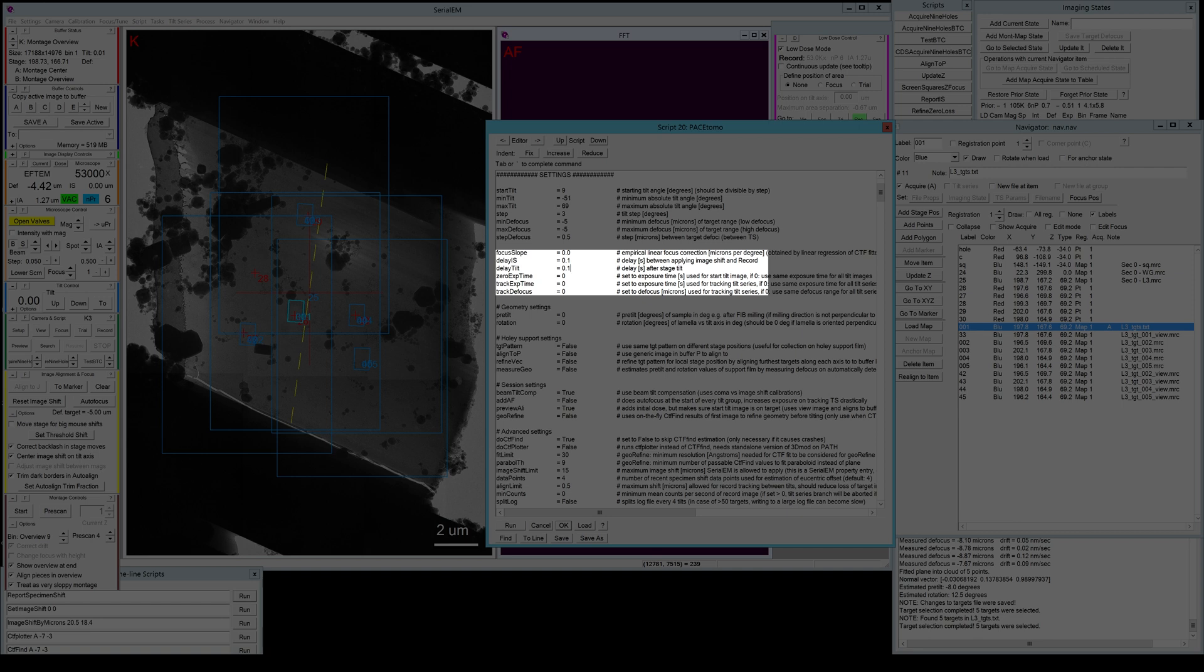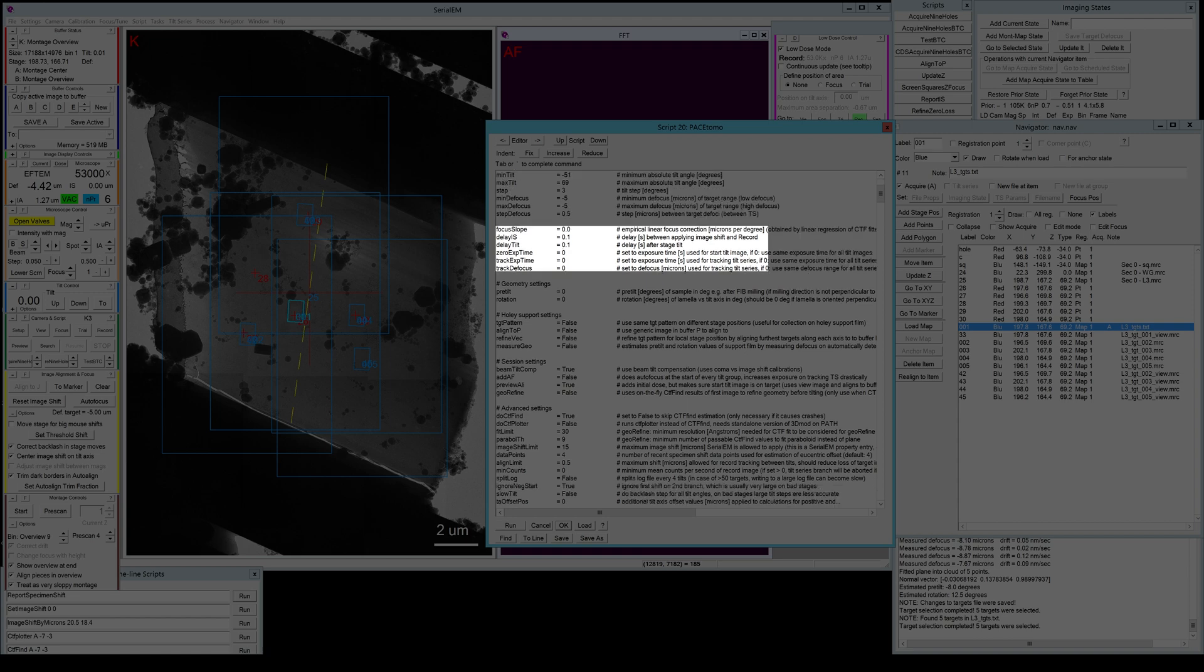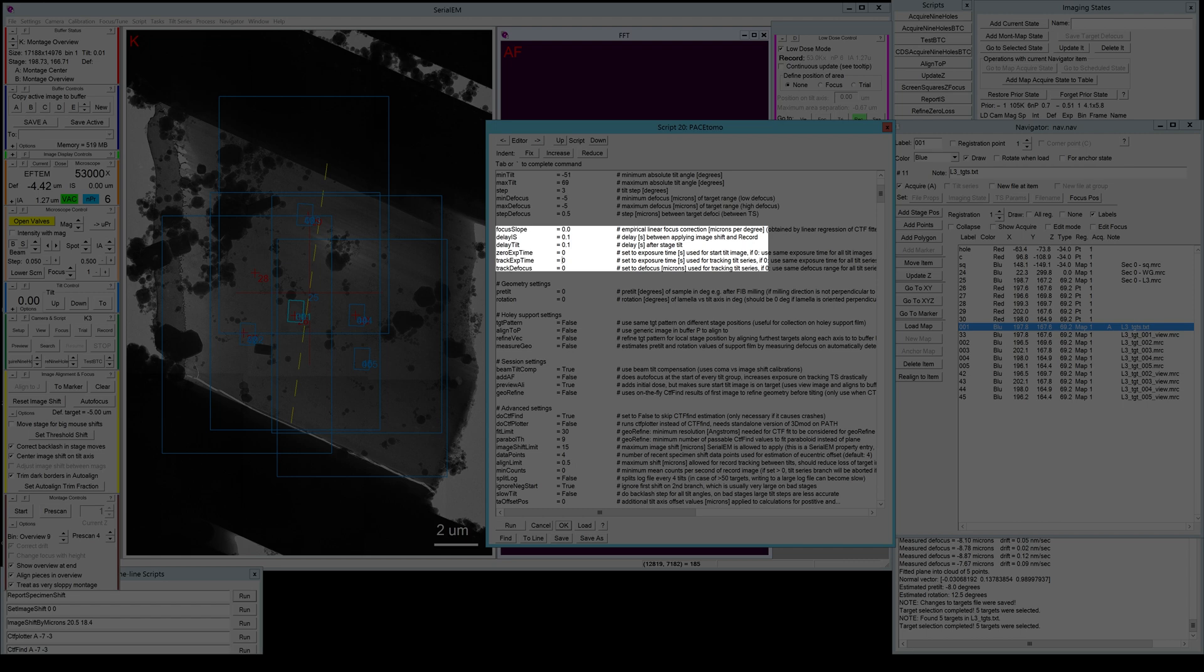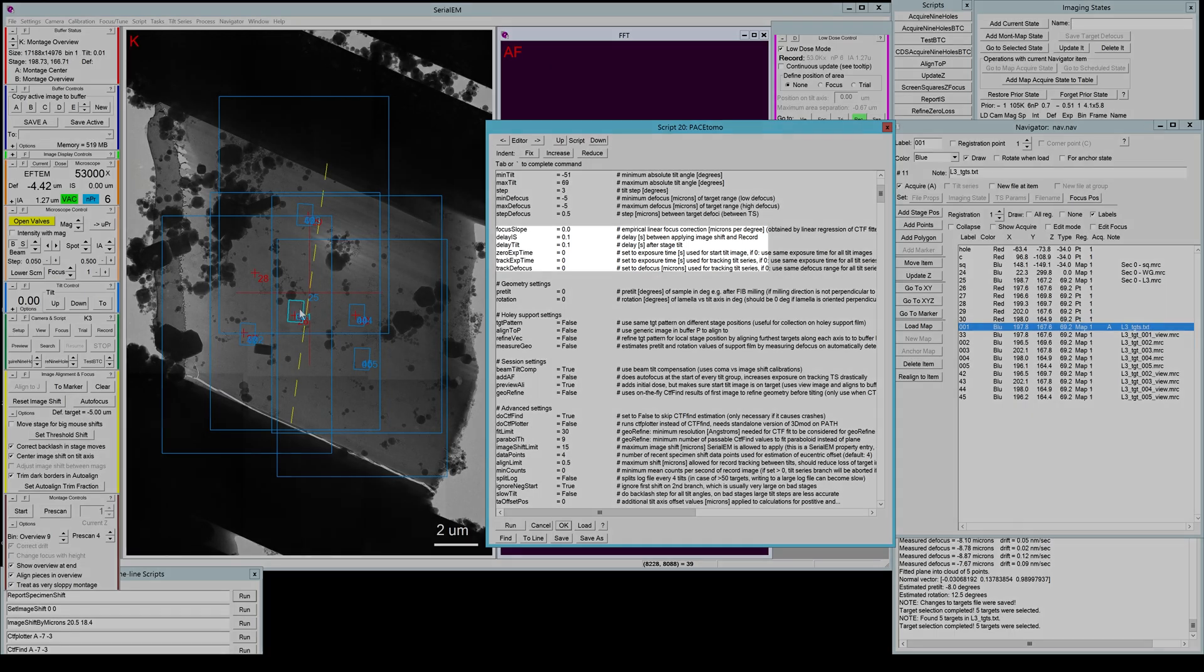Then we have some deviating exposure time settings. If you want to collect a hybrid tilt series where you want to have a longer exposure on your first tilt image for a hybrid single particle subtomogram averaging approach, you can set an exposure time here. If it is set to zero, it will use the same exposure time that you specified in the setup. But if you want to override it for your zero tilt, you can set it to 10 seconds or whatever you like here. And the same you can do for the tracking tilt series. If you want to really make sure that you track your target well and you're not confident in the contrast of your images or if your lamella is very thick, you can increase the exposure time and the defocus of your tracking target.